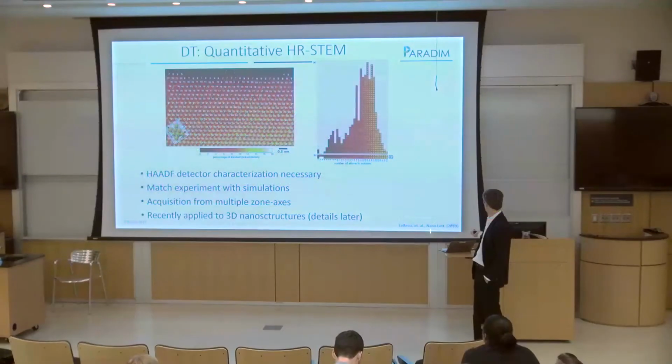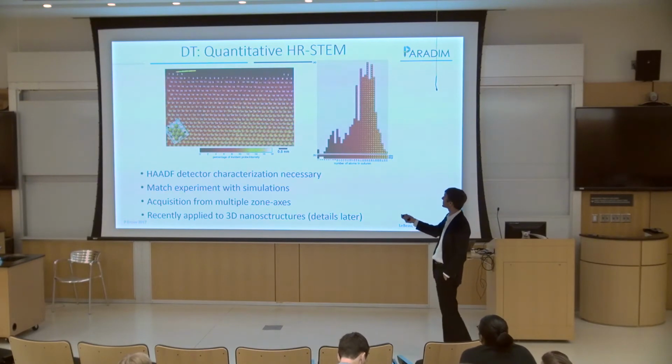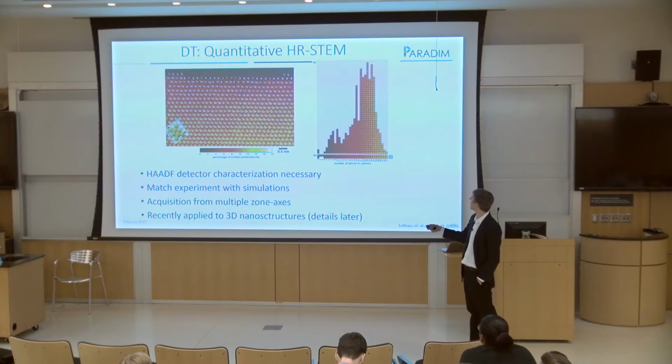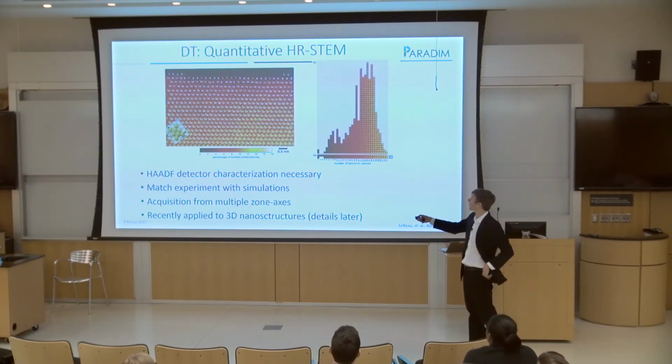This is from LeBeau's paper in 2010. This is now pretty old, and they're doing things far beyond this. But this was the first real demonstration of that, where you can take these columns of atoms. Remember, when we're looking at our object, we're not doing atomic resolution, it's really atom column resolution. You're looking at a whole column of atoms at atomic resolution.